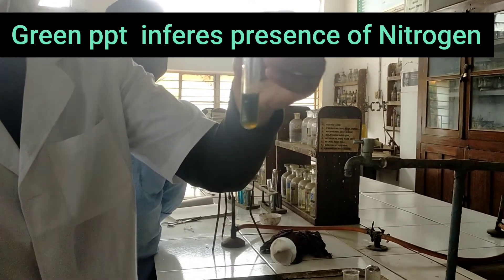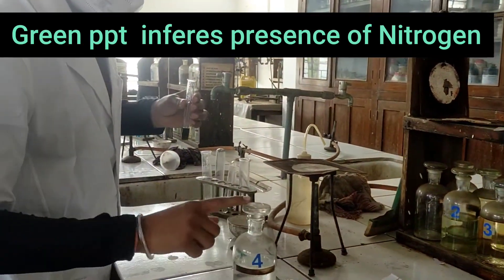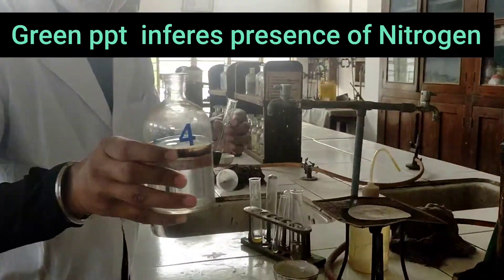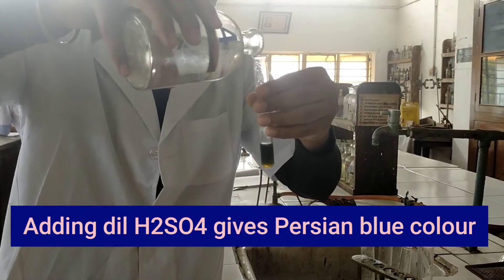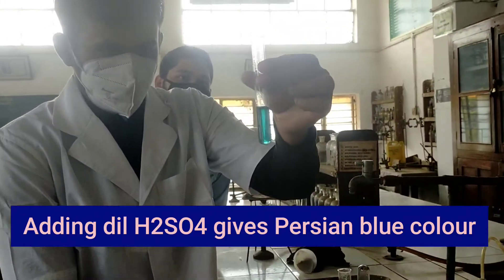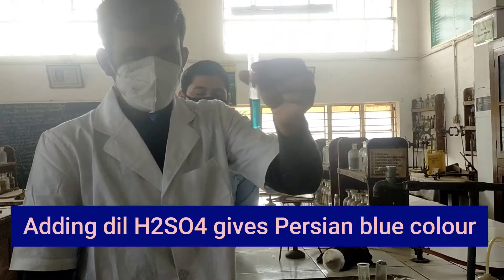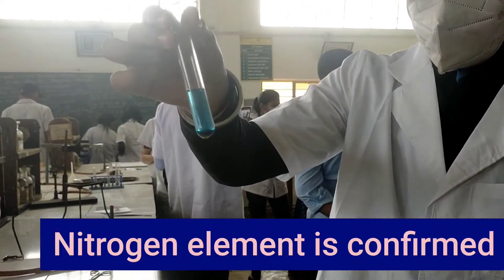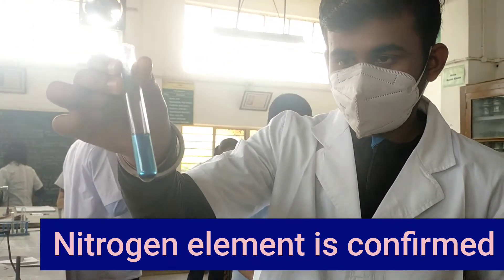Now, further we will add dilute H2SO4 in it. After adding dilute H2SO4, we will see that the green precipitate is getting dissolved. A beautiful Prussian blue color is formed, and this confirms the presence of nitrogen in our compound. We can see the blue color Prussian blue, and now we see that the precipitate has settled down.